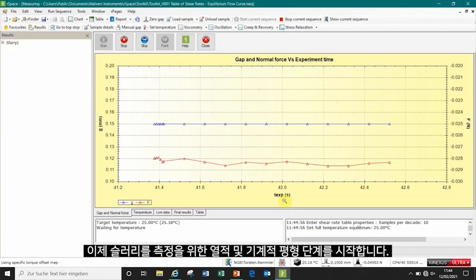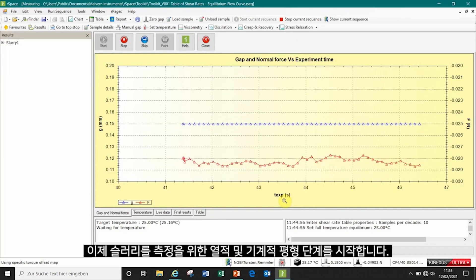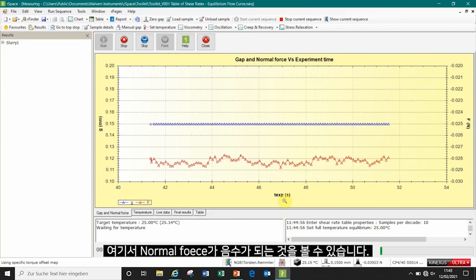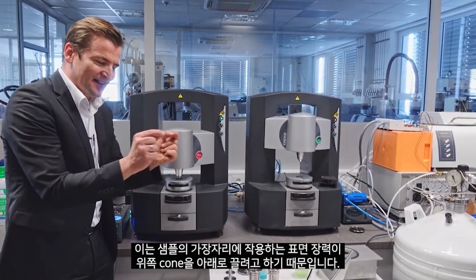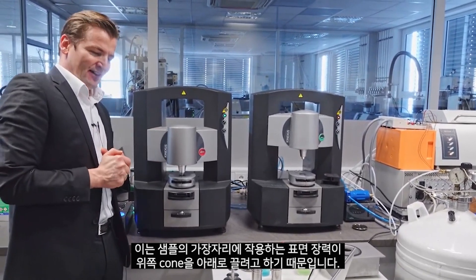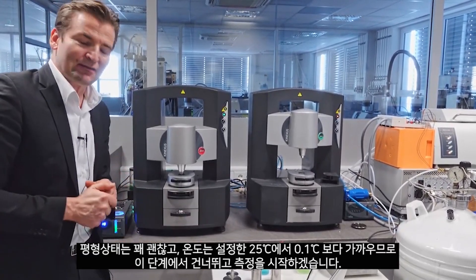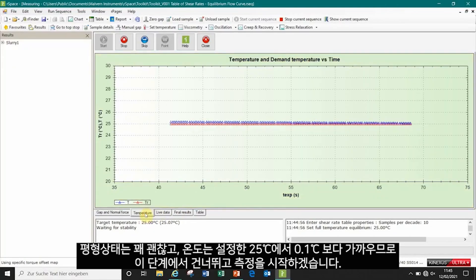Now we are starting our thermal and mechanical equilibrium phase for the slurry. You see the normal force being slightly negative, around zero. This is because of the surface tension acting on the edge of the sample, trying to drag the upper cone down. It is quite well in equilibrium and our temperature is close to 25 degrees C, better than 0.1 degrees C, so we can skip this stage and start the measurement.